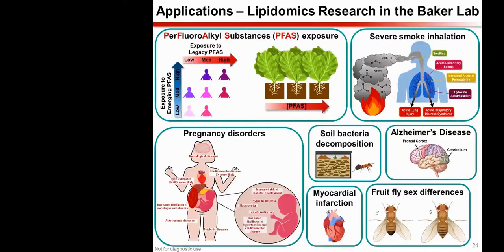And so before I wrap things up, I just wanted to give some examples of different applications that our lab is working on that are using these libraries. So for example, I'm interested in assessing lipid changes in various systems following environmental exposures, such as the ones on the top here, exposures to PFAS or exposures to combustion products in smoke. And so from these more environmental to some more life sciences applications, these lipid libraries are really facilitating a lot of the exciting research that's happening in our lab and hopefully in some other labs as soon as we make them publicly available.